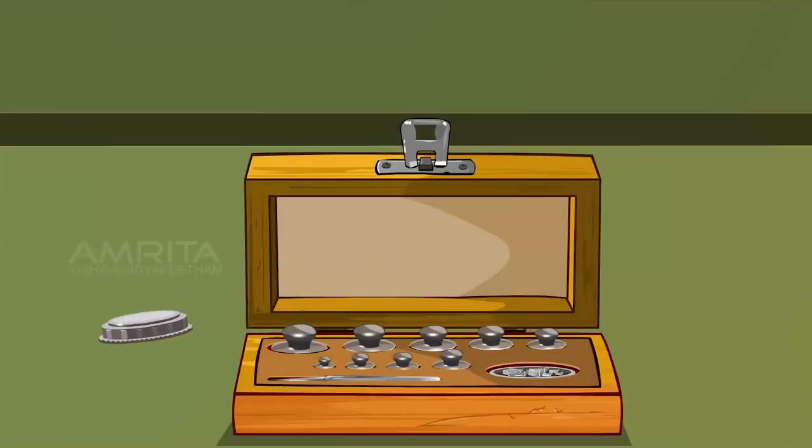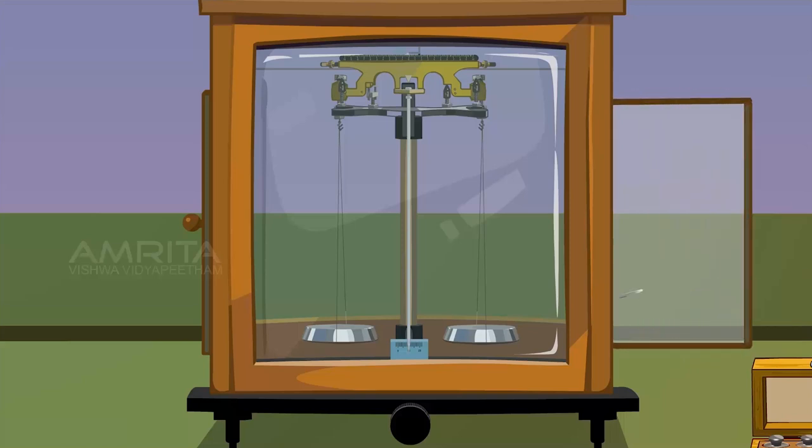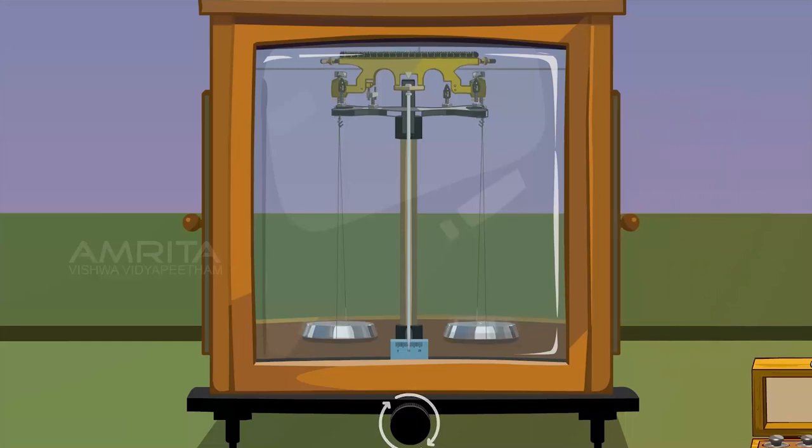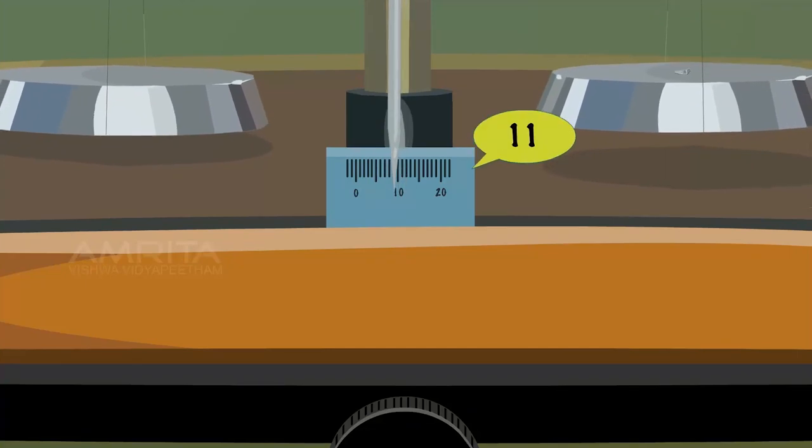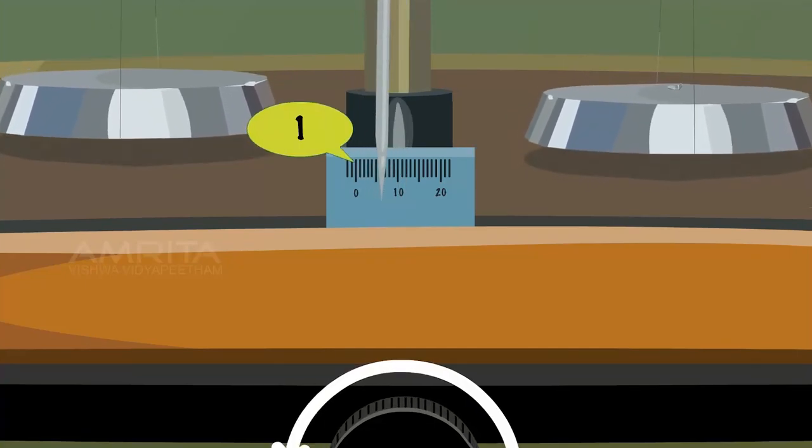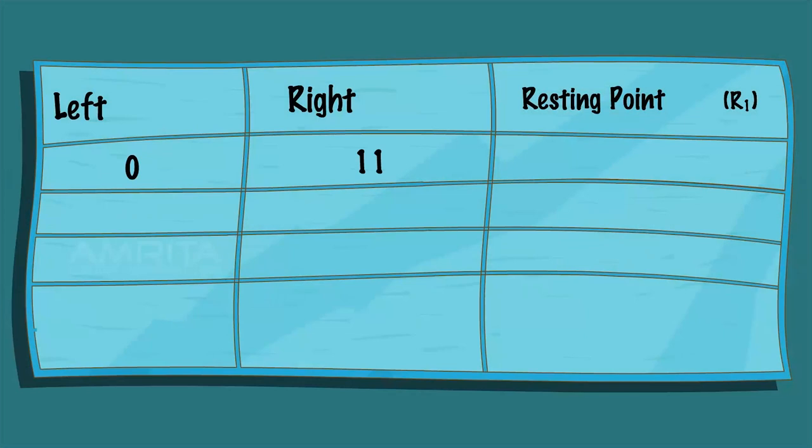Open the weight box and take a weight of 10mg. Open the door and place it in the right pan and close the door. Then the balance is released gently. The resting point R1 is found as before.